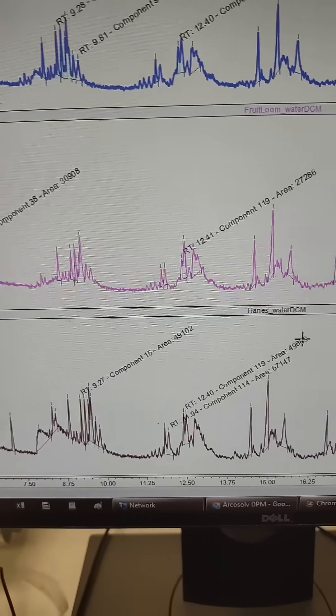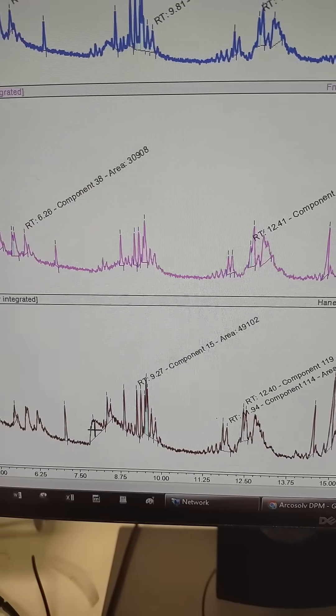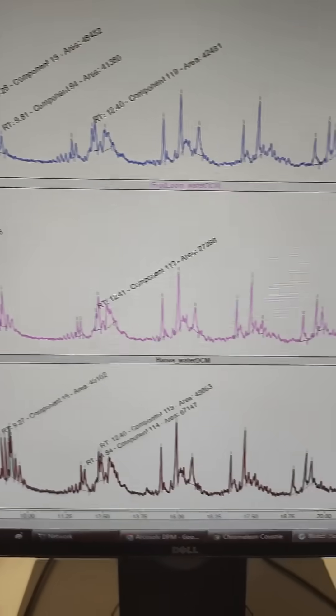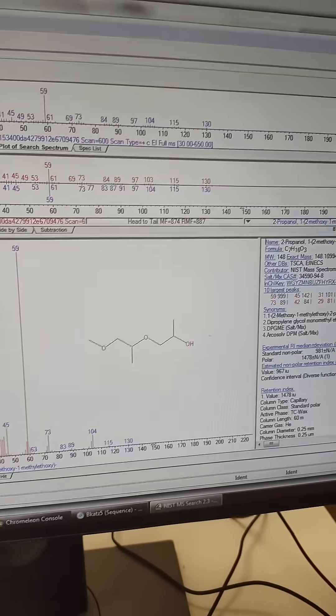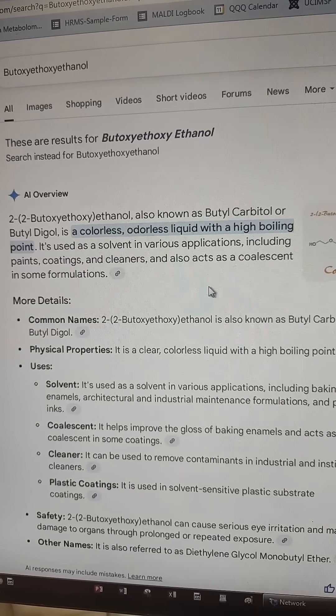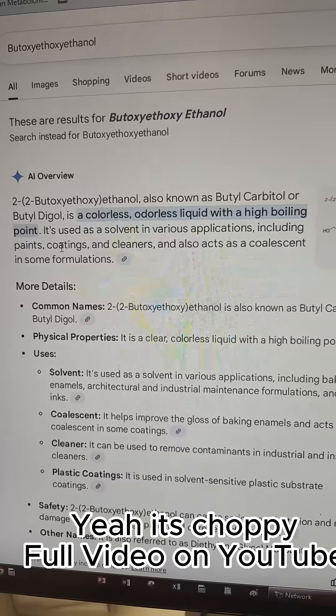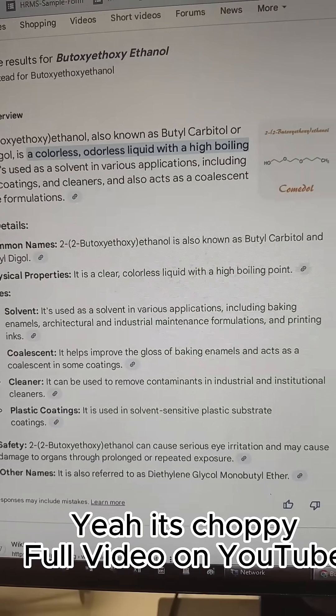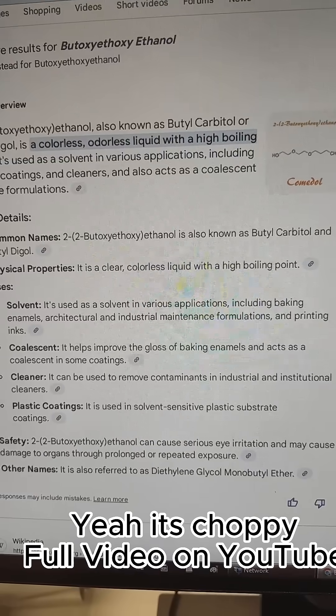In the Hanes, I am seeing this blob here that isn't in the control or anything like that, and that looks like it could be another solvent. This is a higher boiling point odorless solvent used for paints and coatings and cleaners.